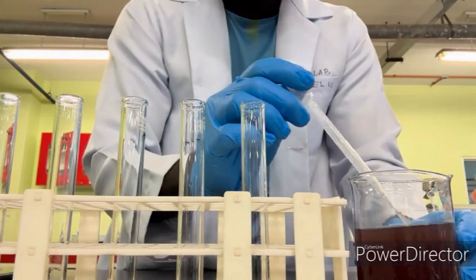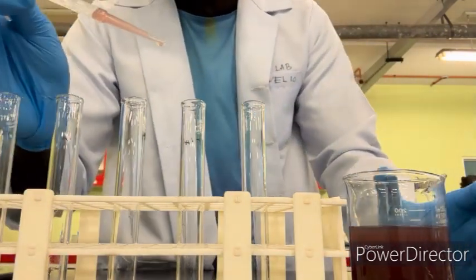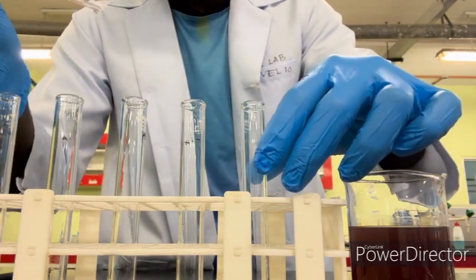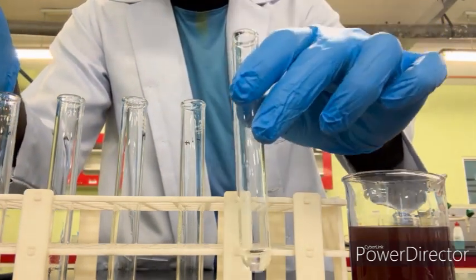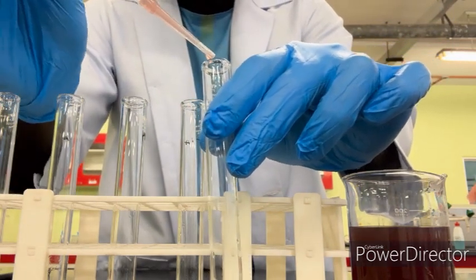Okay, so now this one is a droplet. This is distilled water. We're going to add a final drop here.